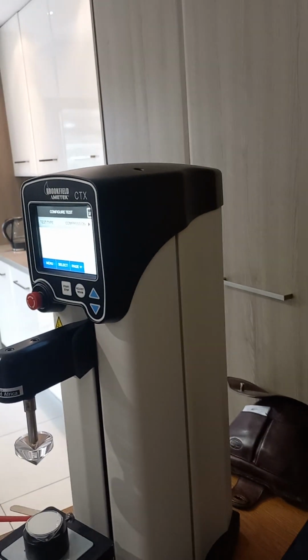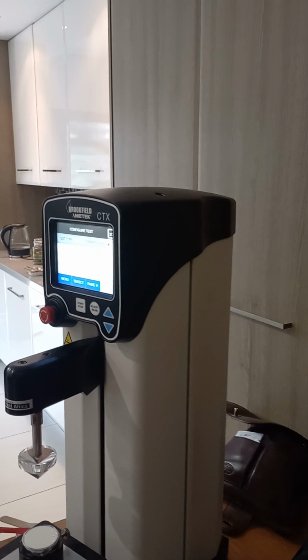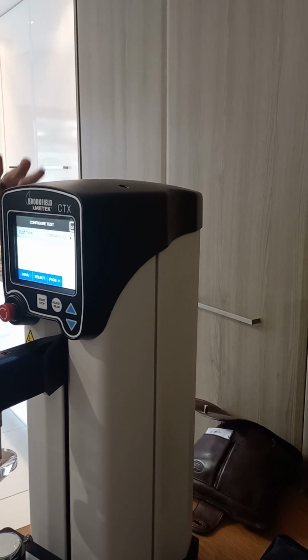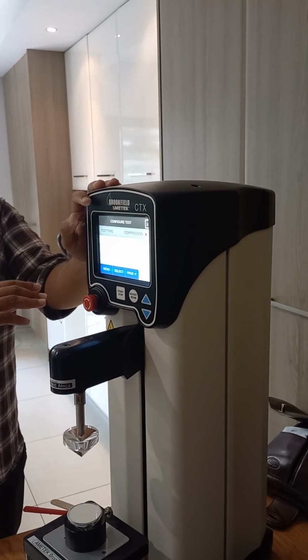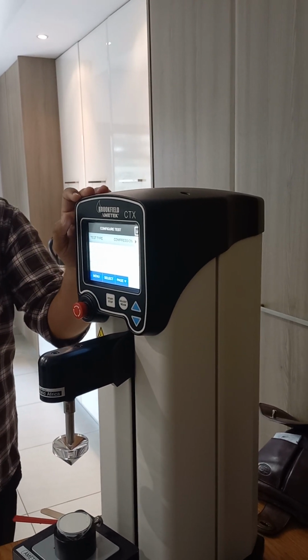Okay. So these are the settings that you will input into your machine to get a specific value. These specific settings must remain constant. If you're going to be testing your sunscreen and you're happy with these settings, you use these settings for your sunscreen continuously.